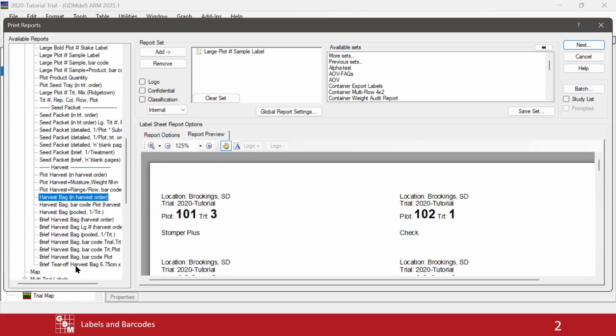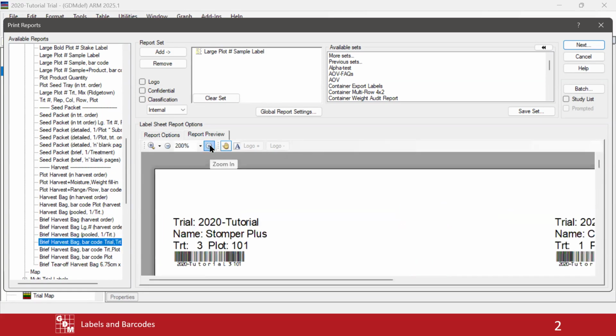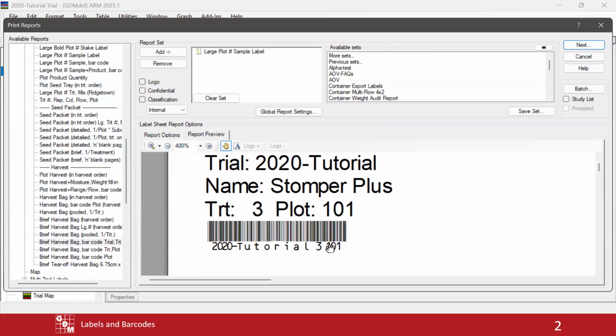And the last category here is that some of these do have a barcode, so kind of the last type of something interesting. I have to really zoom in to actually see this barcode, it's pretty small. But some labels can have a barcode on them. So if you have a scanner, whatever you've labeled, you can just scan that barcode, and whatever you've connected to can then recognize what that entity is.